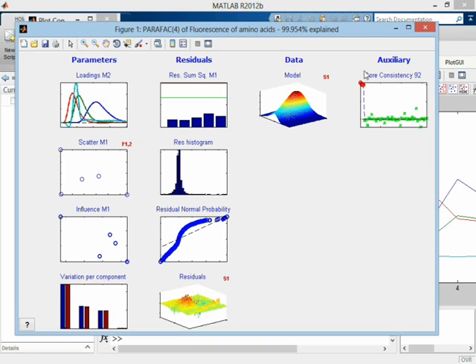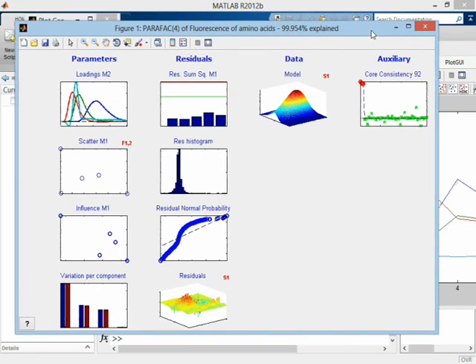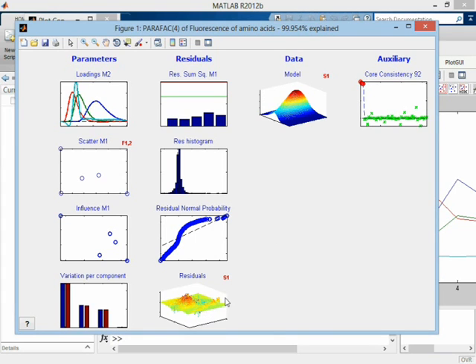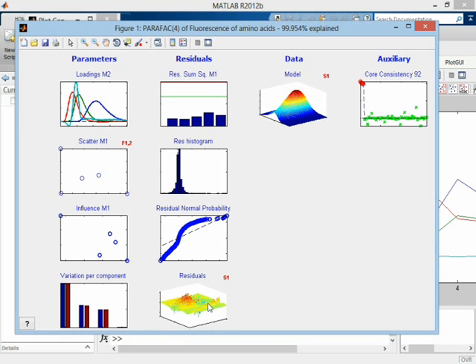But the solution here is, well, we could actually use this four component model. The three and the four component model give more or less the same interpretation, because it's only these three major ones that are big. So we could use both of them. But the real solution here would probably be to handle the scattering, this Rayleigh scattering, in a better way. But that's not really, that's beyond what we are trying to do here. But from a fluorescence point of view, that's what we would want to do, handle the Rayleigh scattering.